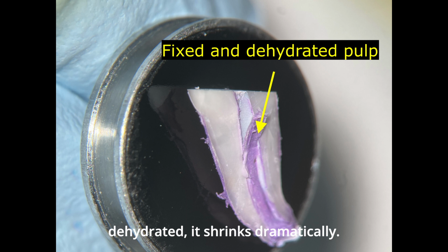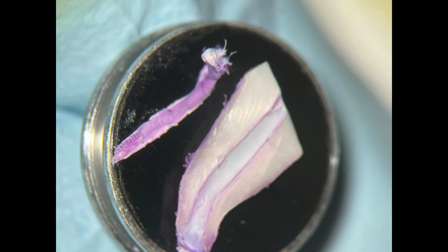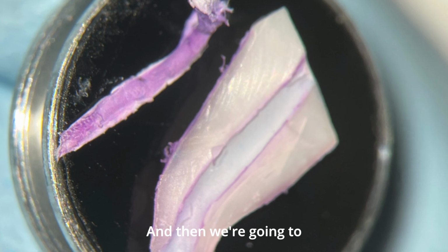But when it was dehydrated, it shrinks dramatically. And this is after a series of alcohol rinses. And you can just take the pulp out and peel it right out of the tooth because it is so shrunken down. It stays intact, it gets hardened, and it peels right off the pulp space, revealing the naked dental wall underneath. And that's what I did in this case. I just dehydrated the specimen and peeled the pulp out.